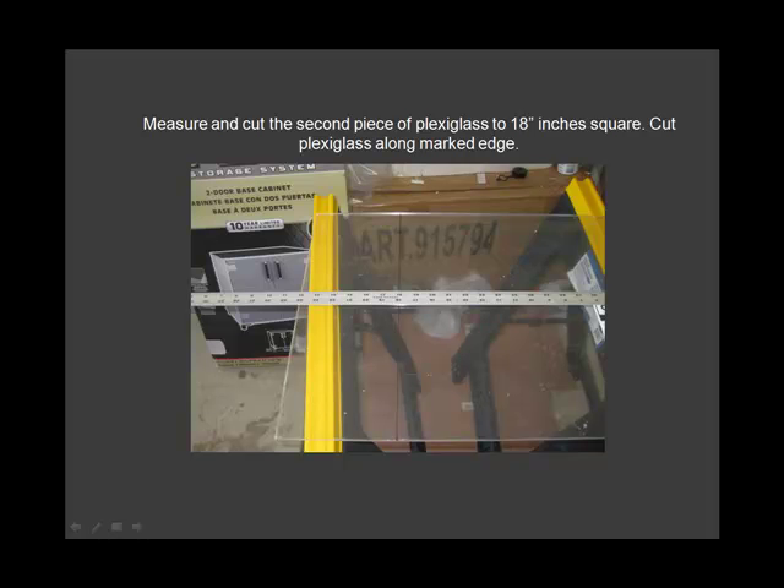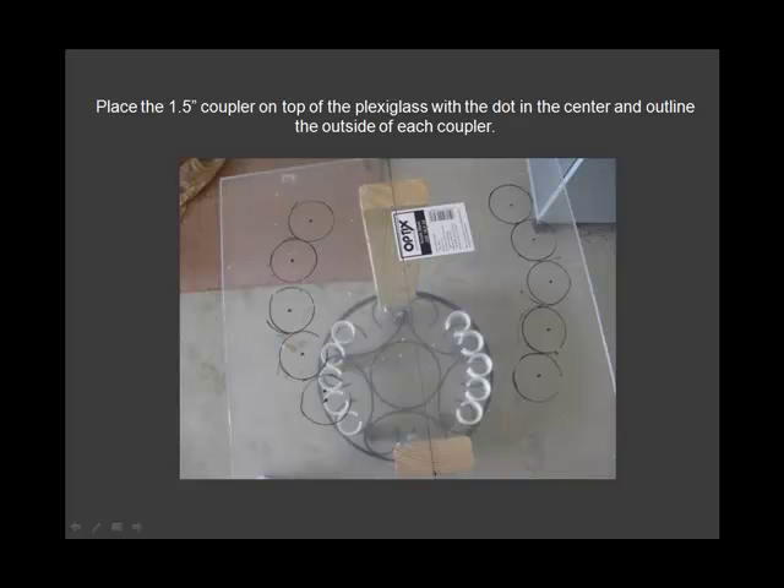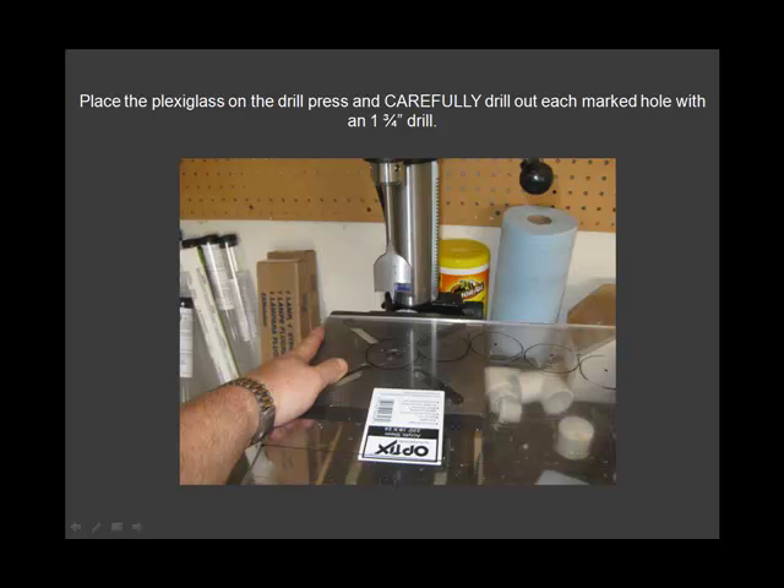Measure and cut the second piece of plexiglass 18 inches square. Find the center of the shell. Place the 1.5 coupler on top of the plexiglass. Place the plexiglass on the drill.